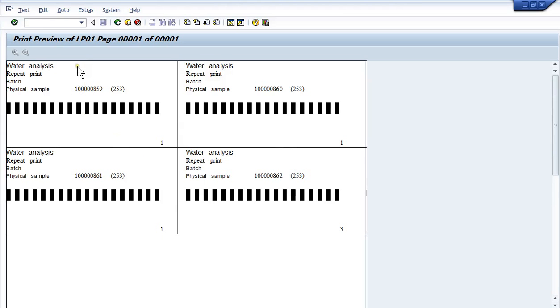You can set it up. This happens to go on a label sheet. A sheet is 2 per side here, and here's your unique number that you can then affix the sample labels to. You can add any type of text, like I would normally have added a text in here saying when it was a retain, saying the retain versus the primary samples.